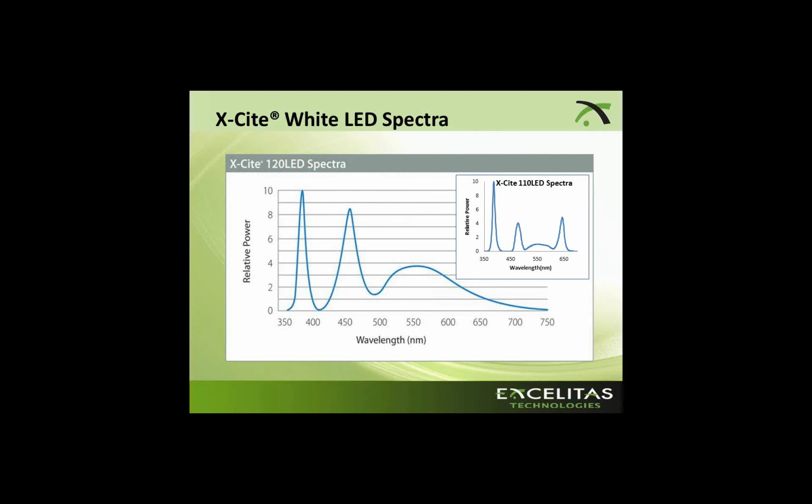As far as control options for these LED units, for those of you who are not familiar with LEDs, they have all sorts of intensity control, TTL control. Some have analog. Some are just simple on and off. But most of them you can control through USB for on and off, or through drivers that are compatible with the X-Cite unit.